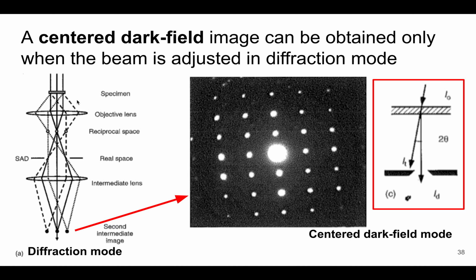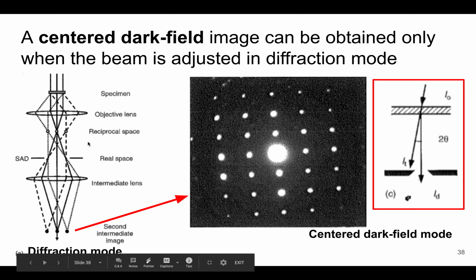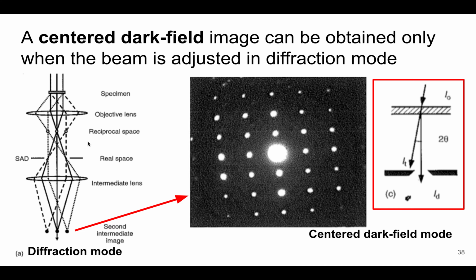And so we effectively manipulate the optics in the TEM such that this reciprocal space that's generated from diffraction is viewed on the screen. And so that's what we mean by diffraction mode, a visual representation of that reciprocal space projected onto the image plane.